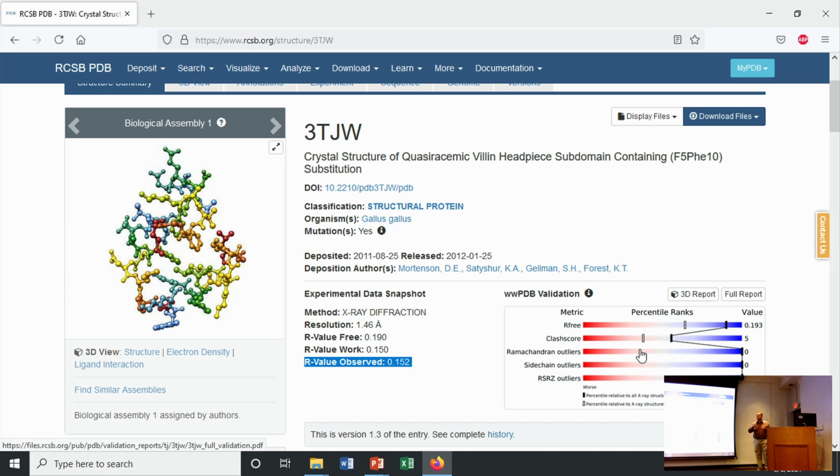So if I put something in some ridiculous solvent, and villin's actually a great example of this, maybe I can get the conformation of my protein to adopt something that's a little bit different than what it might adopt in normal aqueous solution. So just because you have 1 or 2 steric clashes, it doesn't mean that it's the end of the world. If I have a really, really strong electrostatic attraction between 2 side chains, maybe that's going to draw those 2 atoms together more than you might normally see. And so don't be too scared about that.